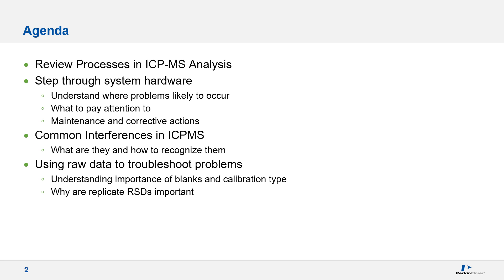The next section will look at common interferences in ICP-MS — what they are and how to recognize them. In the final section, we'll discuss how to use raw data to troubleshoot your analytical problems, specifically understanding the importance of your blanks and your calibration type, and why looking at replicate RSDs is important.